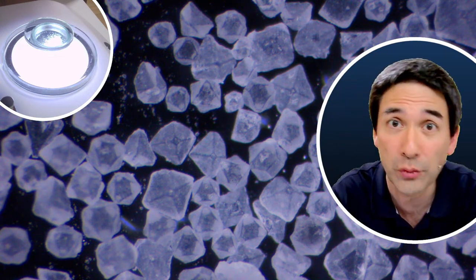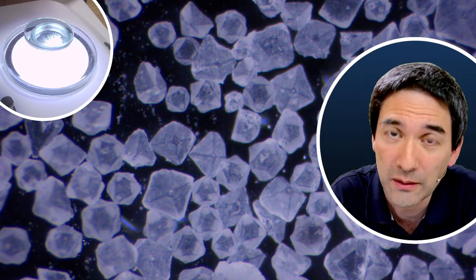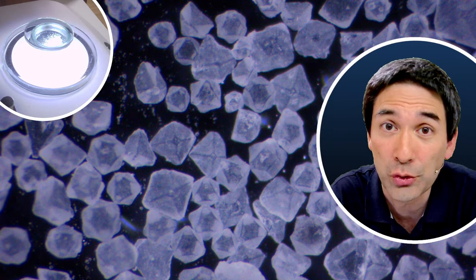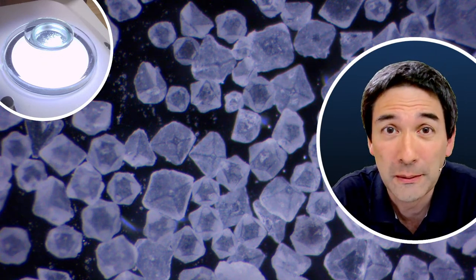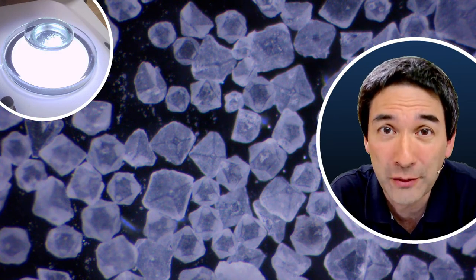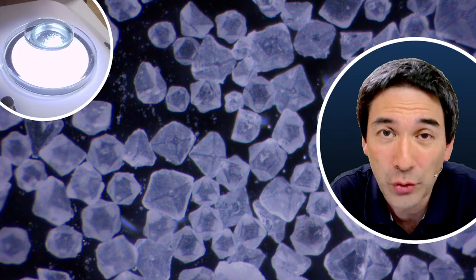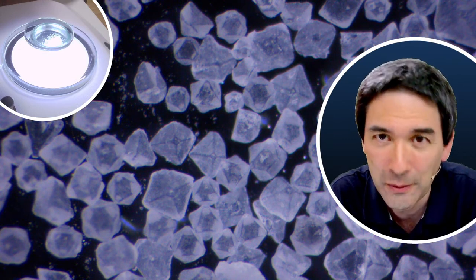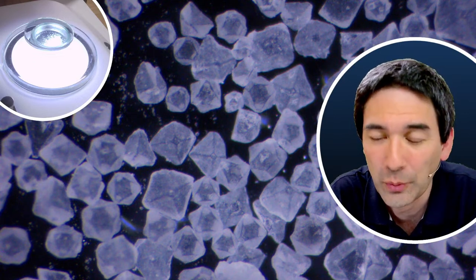And today I would like to do a little bit of polarized stereo microscopy with a polarized light. Normally polarized light microscopy is nothing new. I've been doing videos on that already before, but I've always used my compound microscope for that. Today I'd like to try a little bit of polarized light microscopy using my stereo microscope, because that's something I've not experimented around a lot with.